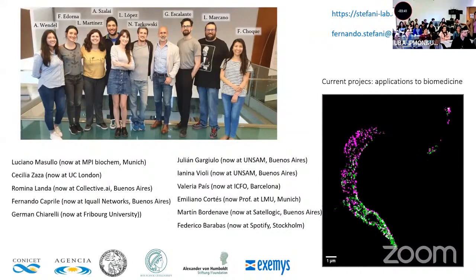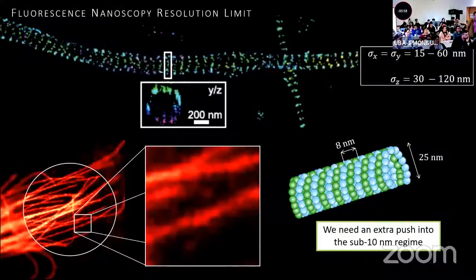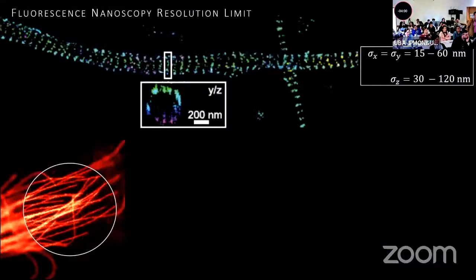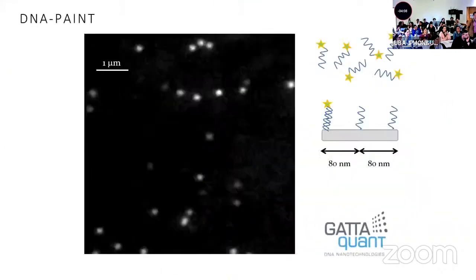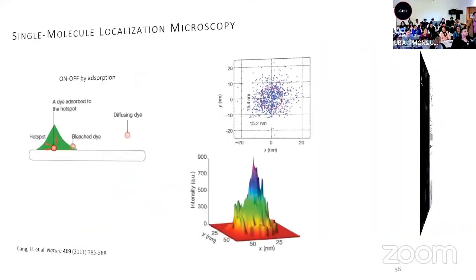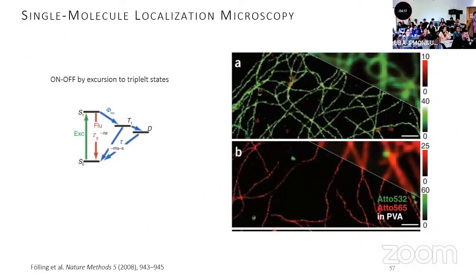Because it is true, I was explaining everything here in 1 dimension or in 2 dimensions. I was neglecting the other dimension. But I showed you some of the 3D, and in principle, these concepts can be extended to 3D. But if you just take a conventional microscope and you don't do any trick, what you will collect is a projection of all the optical section that you are analyzing.